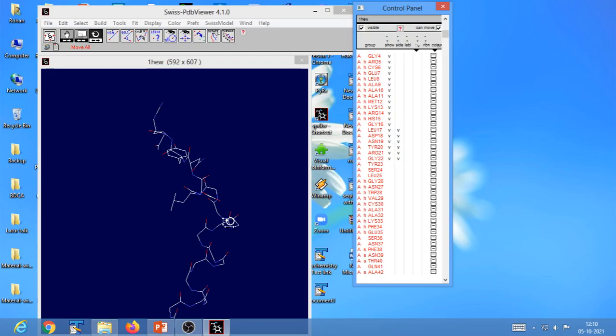Now there are also two narrow columns. We are talking about these two narrow columns at the left of the group columns. The first column is populated with letter A, as you can see over here. In previous revisions of this entry, this column used to be blank. When the current model contains only one protein chain, it might happen that this column remains blank.